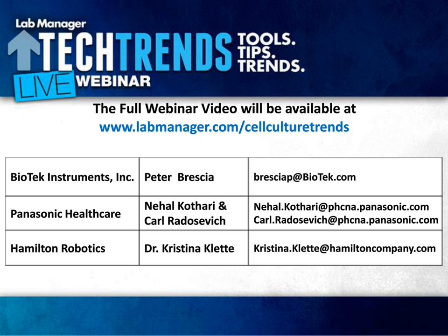Peter, I'll direct this question at you. How good is the technology that you mentioned for culturing neurons and neuroglials for long-term use? We have done some work with neurons as far as tissue culture. I'm not sure, one of my colleagues has been doing some work with that, and I'm not sure to what extent he has automated that yet. We have not done a lot of high throughput screening.